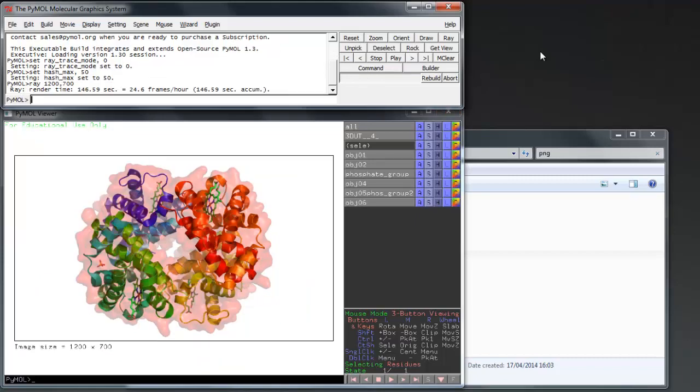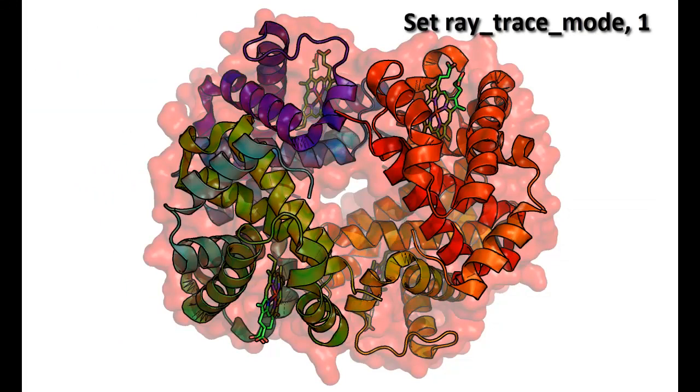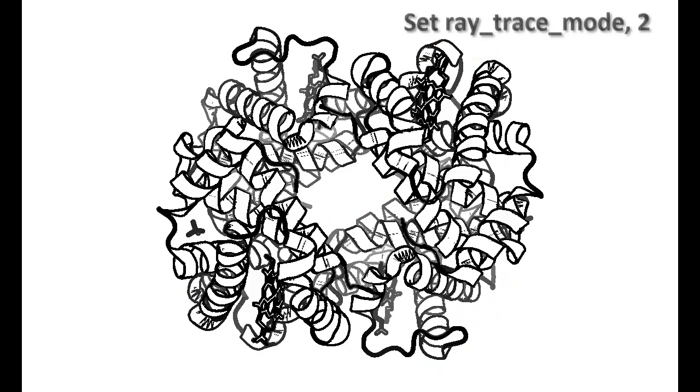To add variety to your images, use the command set ray trace mode and then 0 to 3. One will have normal color with a black outline, and two will only have a black outline.